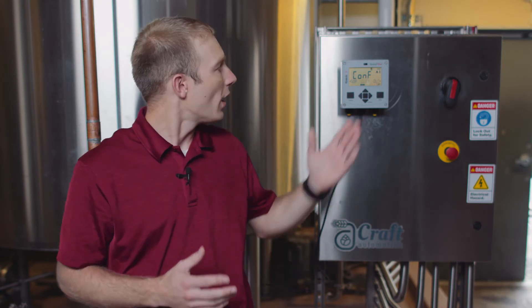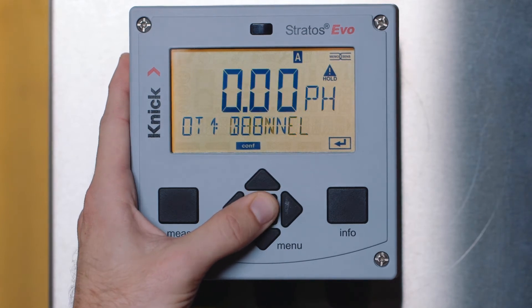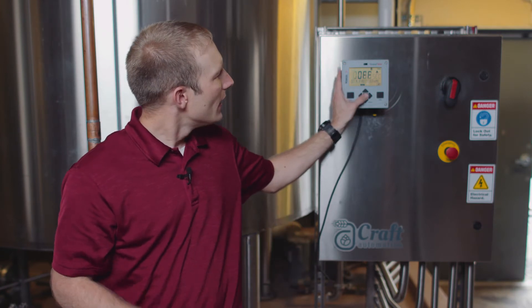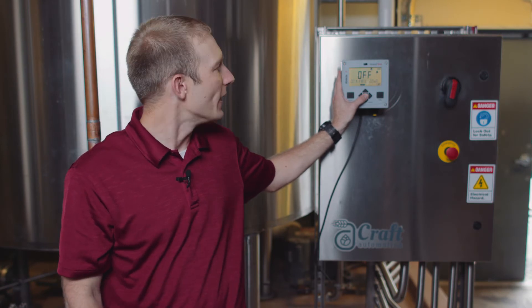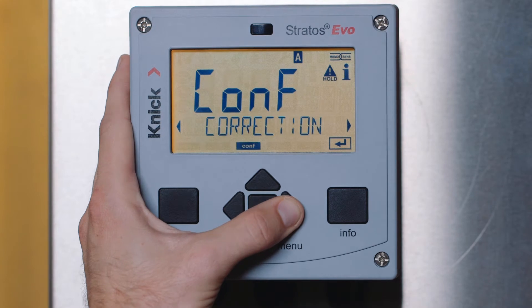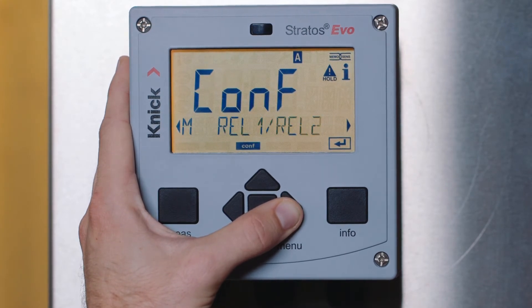After we have configured our sensor, we can now configure our outputs to our control system. Here, you have the ability to set up the two 4 to 20 milliamp outputs provided by the Stratus Evo transmitter for our desired pH and temperature range. Within the output configuration, we can also apply a filter time for dampening, as well as set the failure mode to drive the output to 22 milliamps. Toggling to the right, you can also see the additional features and relays that can be configured within the Stratus Evo.